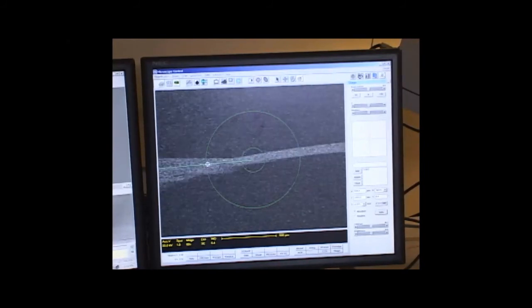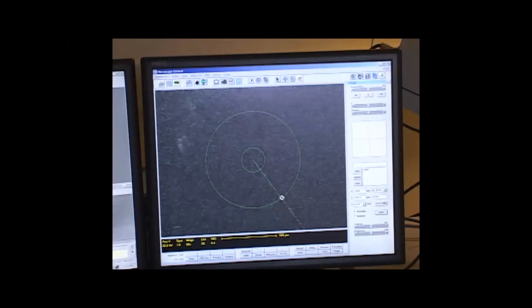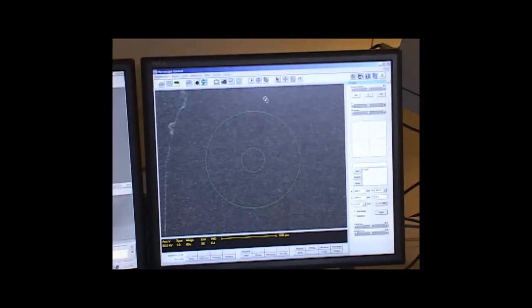And I'm going to focus the beam in the corners. Each of the 4 corners will be focused at a slightly different height because the chip won't be perfectly flat. As I collect those 4 corners then, the NPGS program will calculate the plane of the chip so that it can focus no matter where on the chip we actually write the pattern.